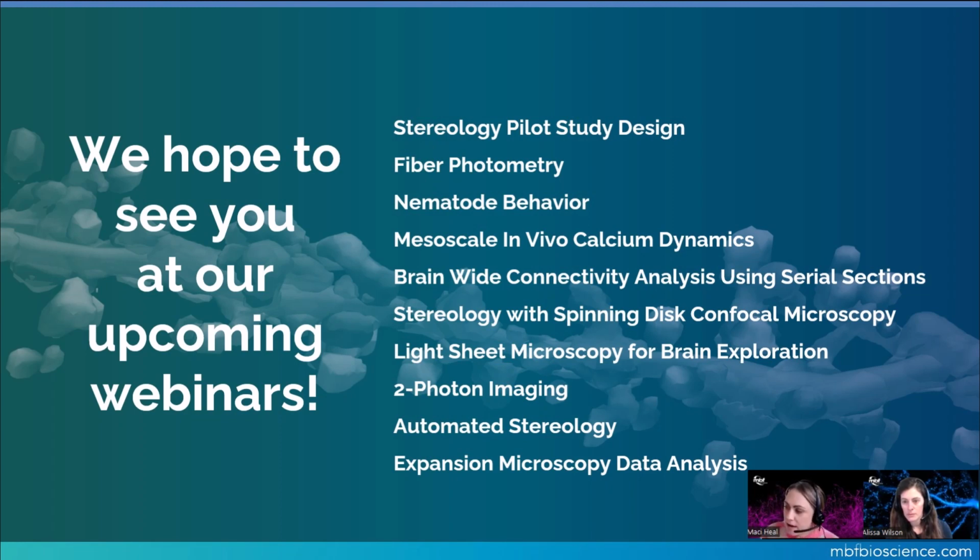And again, we do have an eval trial demo program. So if you have a system and you're really interested in how it's going to perform, we can work with you on getting it set up and trying it there and seeing what priorities would need to be made to upgrade the hardware on the computer, or really diving into some of the tools we showed earlier, with the subvolume and the projection tools, to limit that.